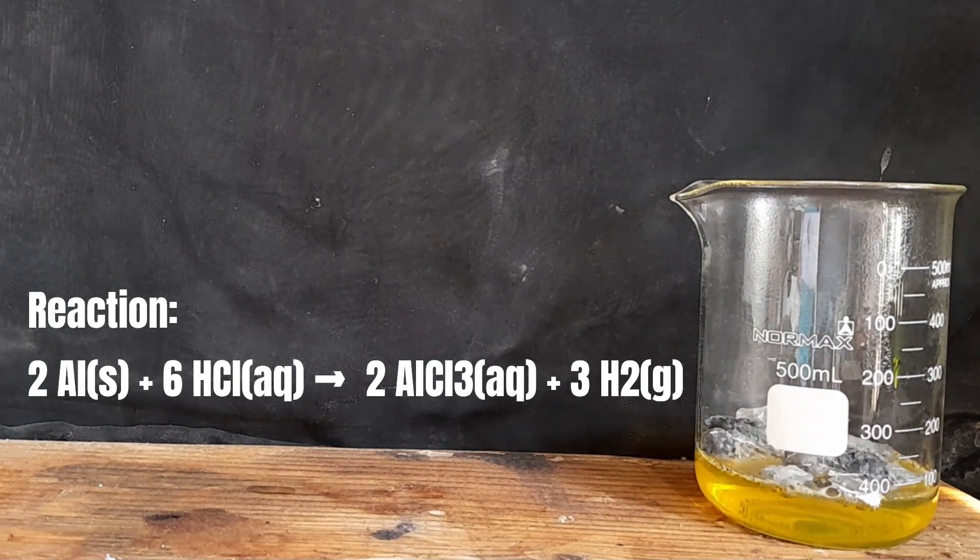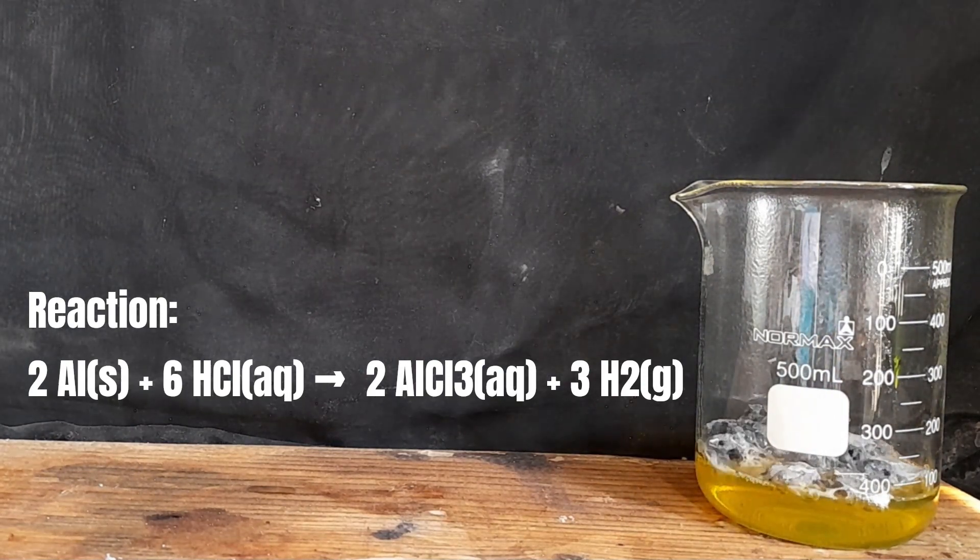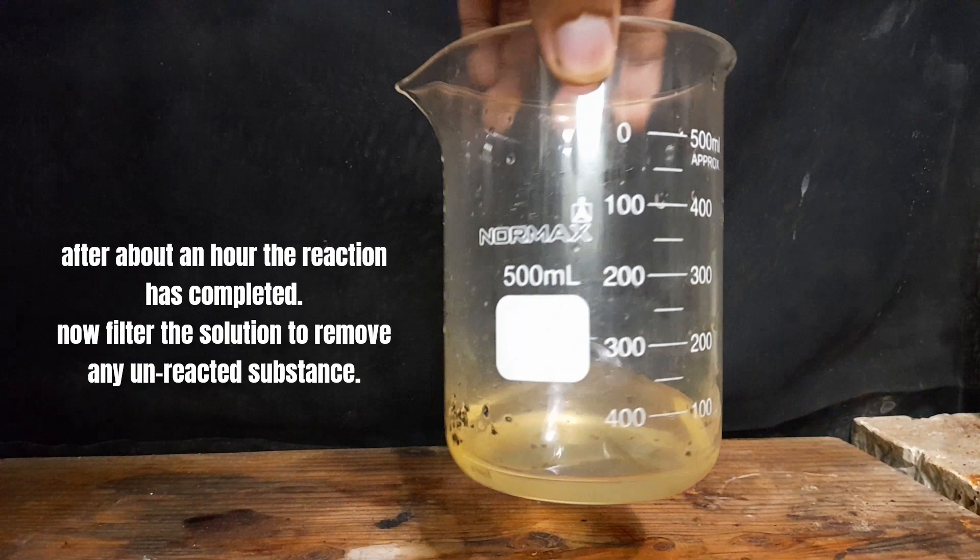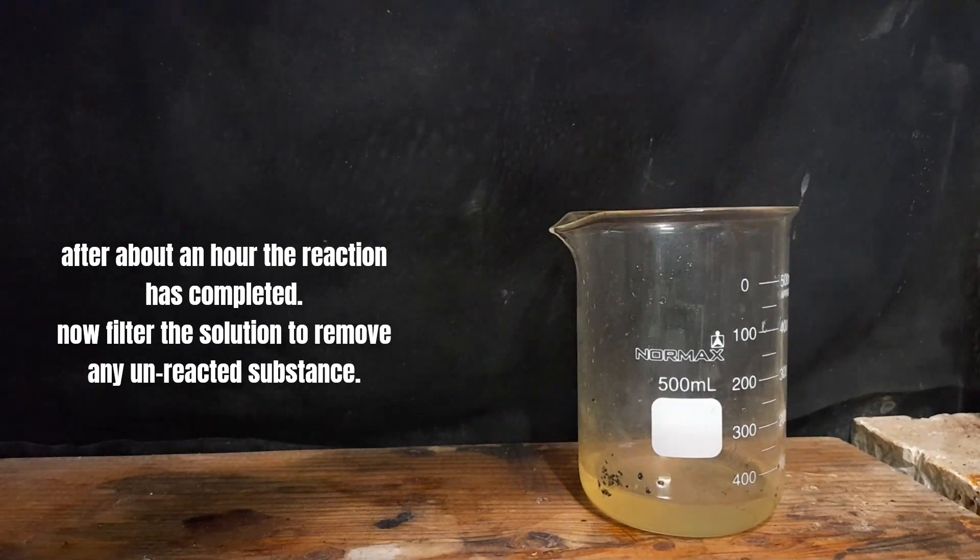Aluminium react with hydrochloric acid and synthesis hydrogen gas and aluminum chloride. After about an hour the reaction has completed. Now filter the solution to remove any unreacted substance.